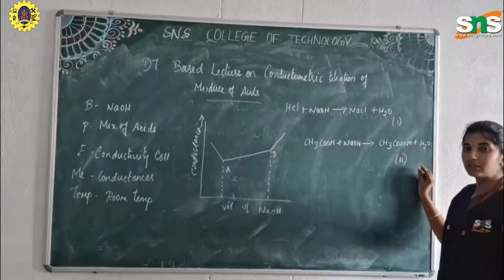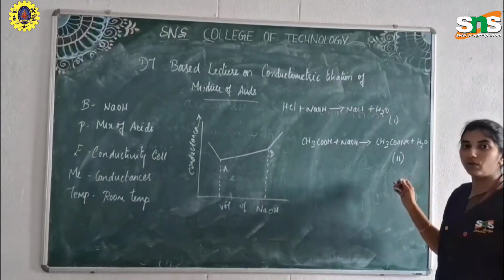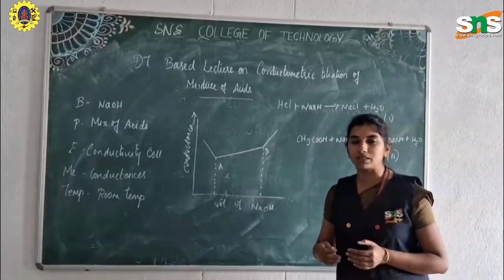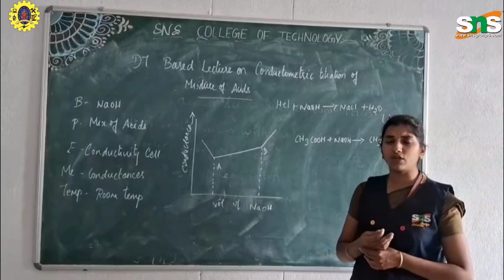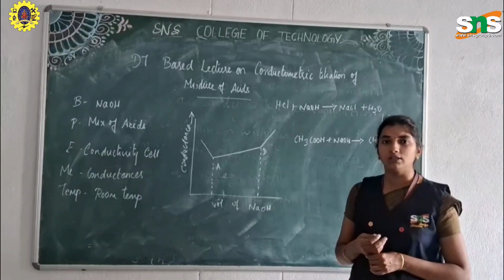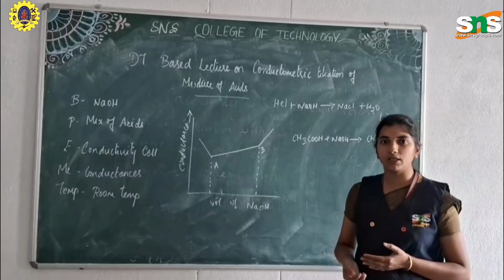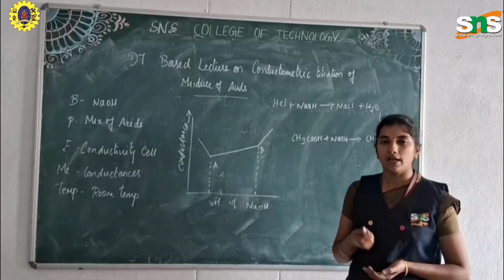Using these principles, the mixture of acids, when combined with the conductivity measurement, shows the electrical behaviour, and the conductance values from the higher peak range to the lower peak range can be observed in this experiment.